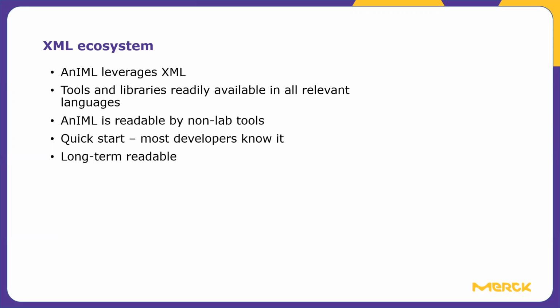And I can take an AnIML file, throw it into Crystal Reports, and get a decent report out of it, even though the people who wrote Crystal Reports probably may not have known what a lab even is. And this quick start is really powerful. Most developers already know XML, and the long-term readability obviously makes it an ideal choice for archival scenarios.